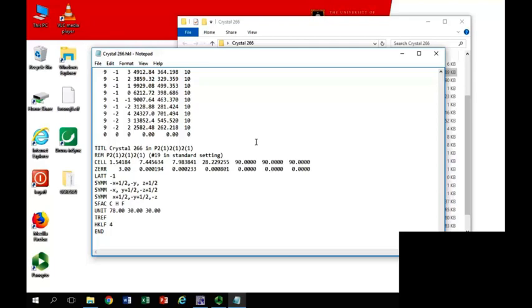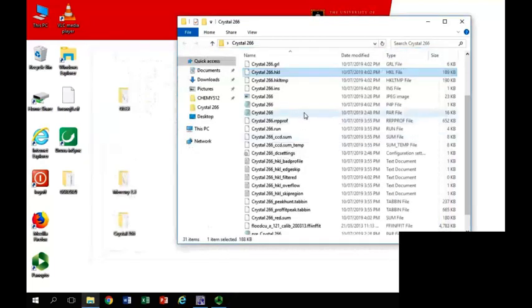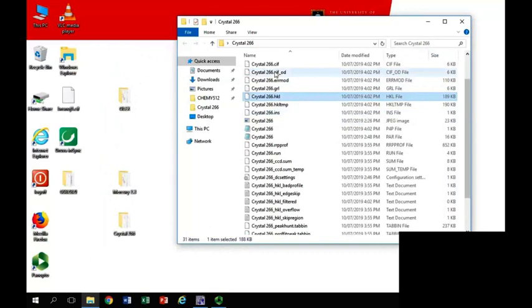So just be aware that you may have to look up whether the space group you get is actually a standard setting or a non-standard setting. If it's a standard setting, it's going to be one of the 230, and it's going to be as written. They're all in the international tables as well. So P21 upon A will be in the section under P21 upon C. Okay, let's look at.